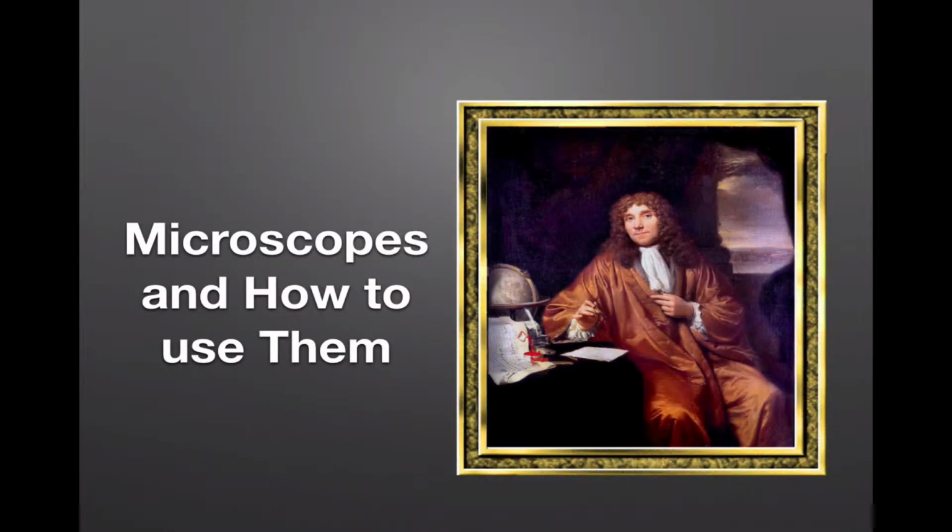Hello, this is Ed Chapman, and this video cast is going to be about how microscopes work and how we use them, focusing also on the different kinds of microscopes that are currently available in different types of labs.